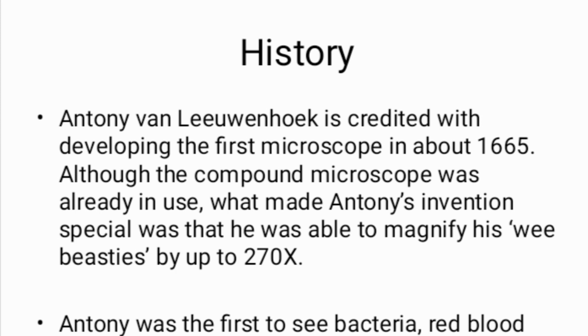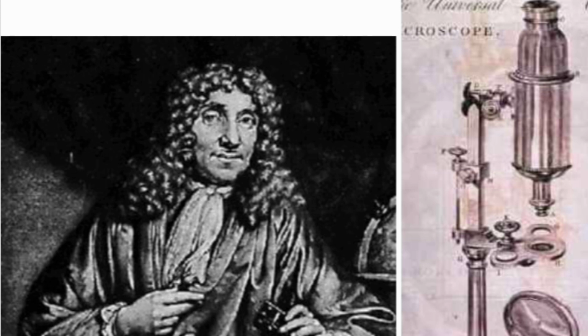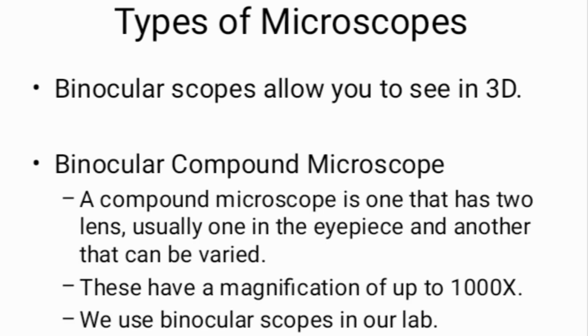But for those of you watching the tutorial now, please take note of this name, Anthony van Leeuwenhoek. You may be asked in your test or exam, and also just master the name and the year. All right, let's move to the next slide. You can see the microscope and the picture of Anthony van Leeuwenhoek. You can see it. So next slide.